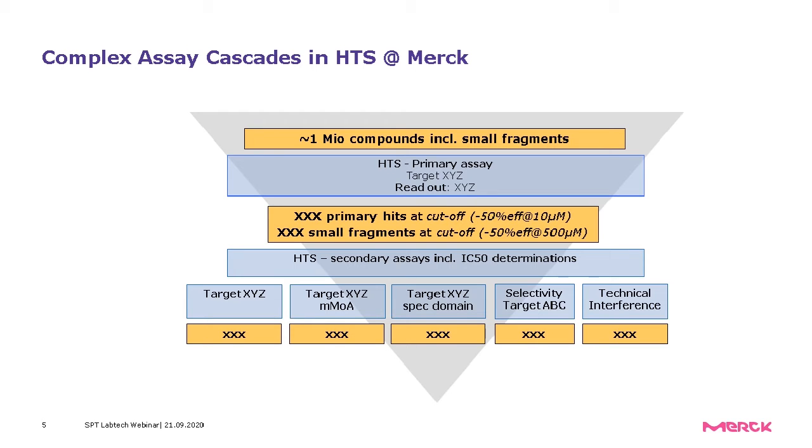So what I want to mention here, we can run one screening, but in the end we will have multiple DRC runs, usually 3 to 4 runs. And this means for every DRC run, we are having a specially designed assay for this.